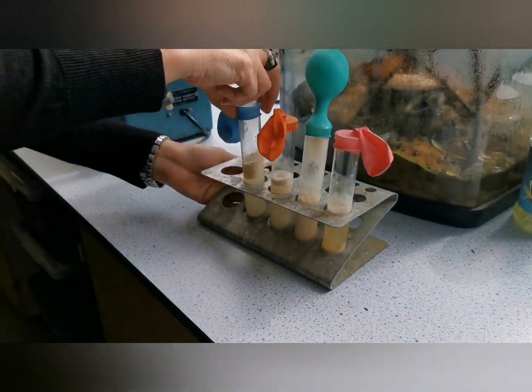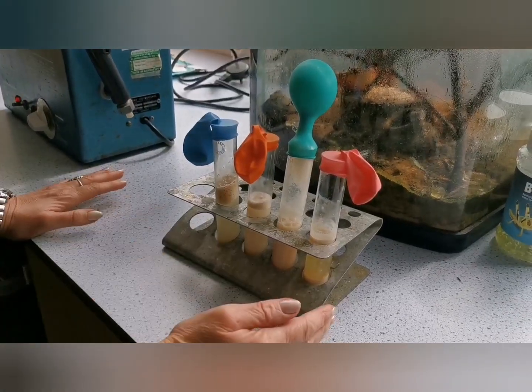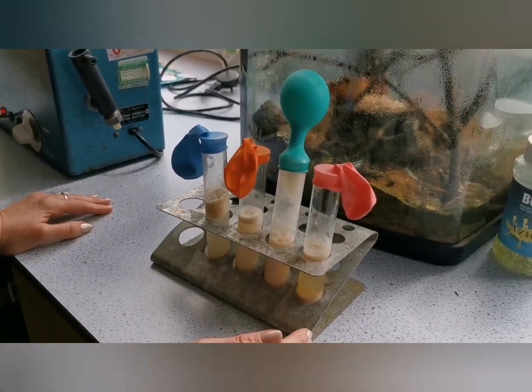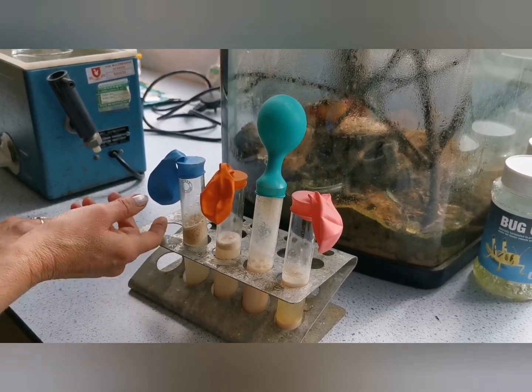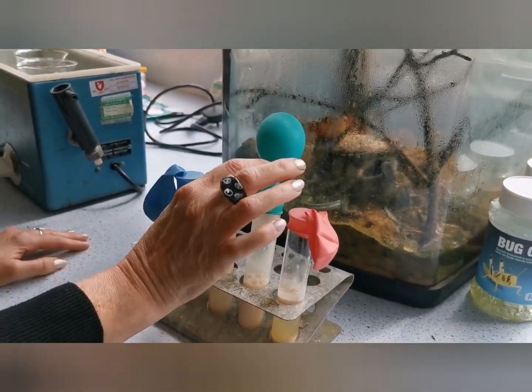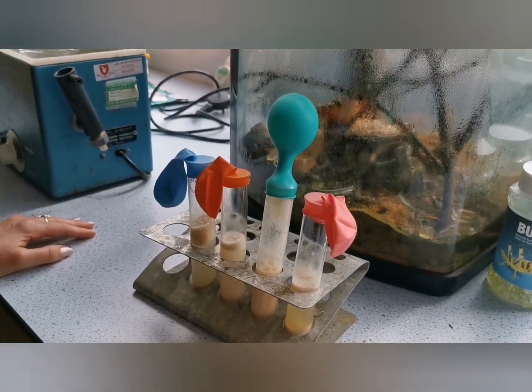So if we put these together, it is very clear to see which temperature our microorganism, our yeast, prefers. So it's a bit like the 3 bears. Oh, not too hot. Oh, not too cold. Not too cold either, but it likes it at this temperature. This temperature is 40 degrees.